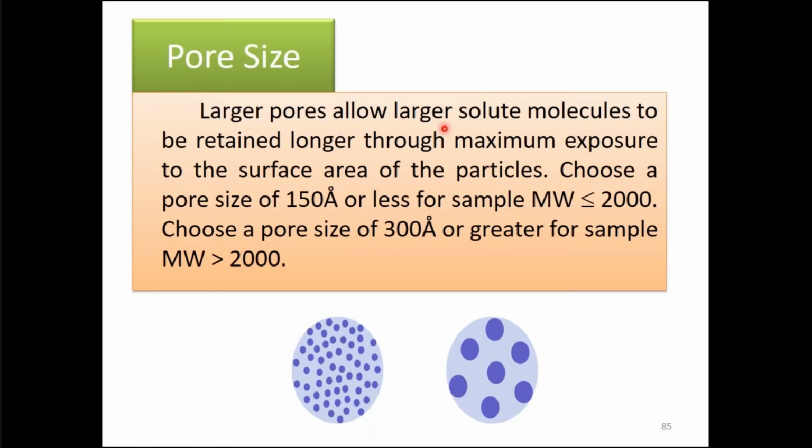Larger pores allow larger solute molecules to be retained longer through maximum exposure to the surface area of the particles. When can you get larger pores? When the particle size is large. Okay, so we have to decide based on what type of solute molecules you have. If your solute molecule cannot enter the pores, then it will just get washed away with your mobile phase. There will be no separation.